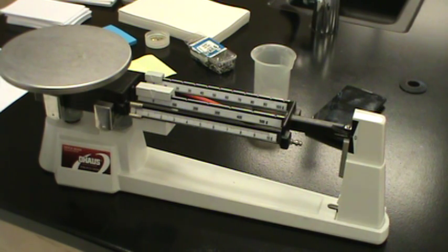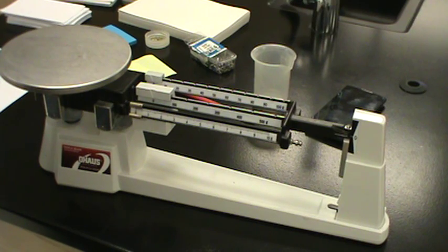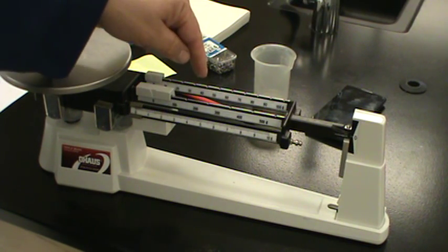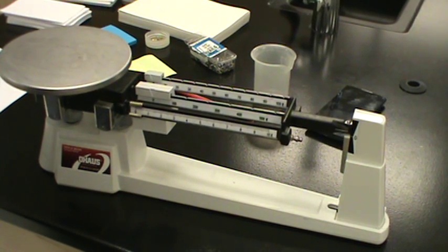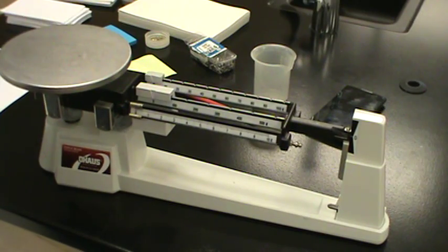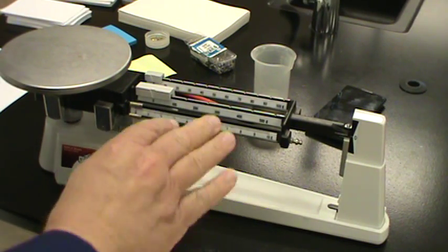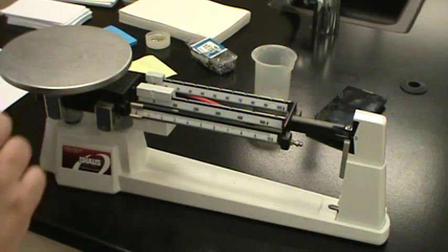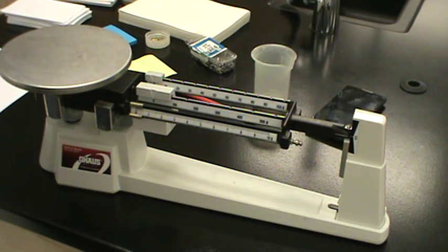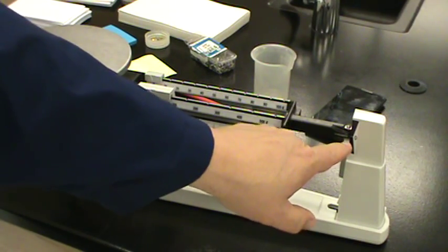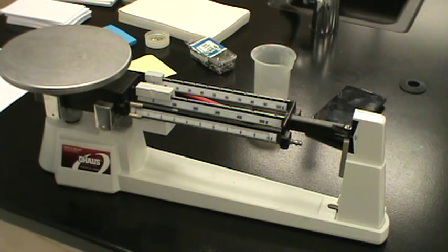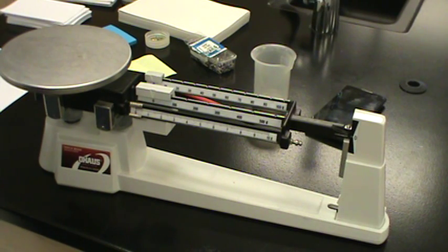Don't know how to use the triple beam balance? Not a problem. It's called a triple beam balance because there are three, one, two, three beams that go across. And it's a balance because the idea is to get this to balance, and for two lines that are right here, which are very difficult to see on camera, but there's two lines right here that need to match up at zero to tell you that it is indeed balanced.